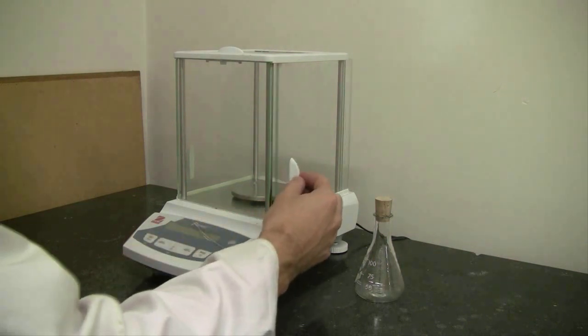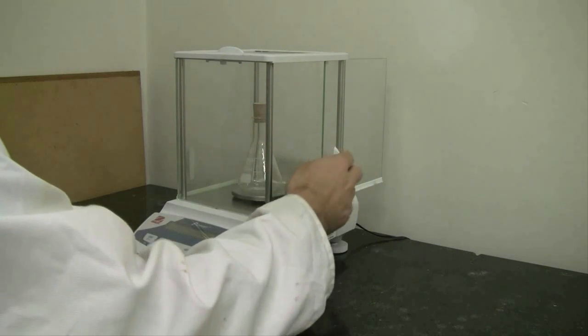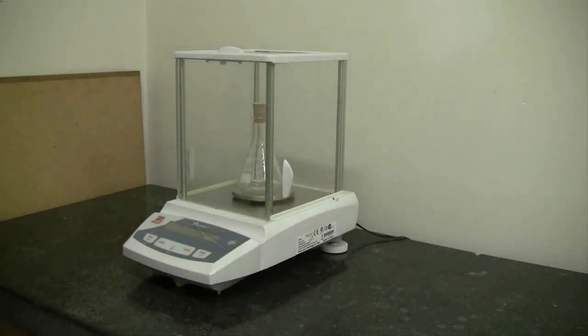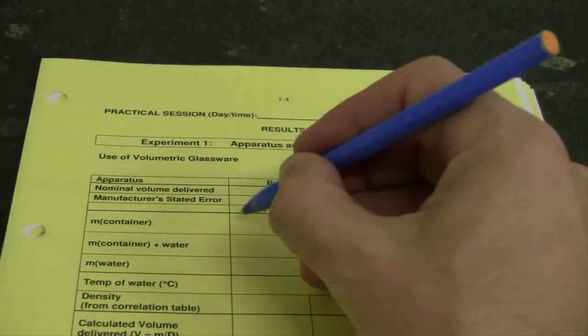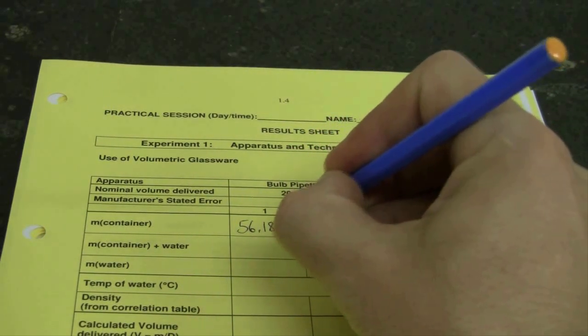Start by taking a 100 mL conical flask, taking it into the analytical balance room and accurately weighing it on an analytical balance. Make sure you record all four decimal places for your mass and when you take that reading make sure all of the balance doors are completely shut.